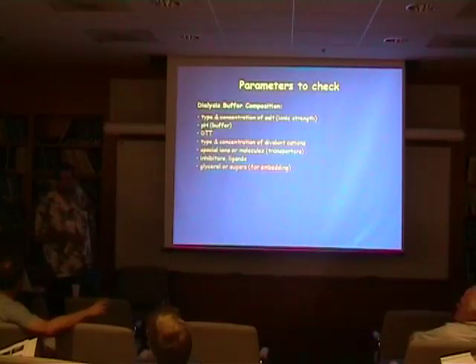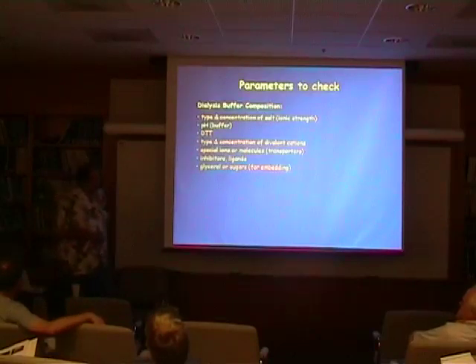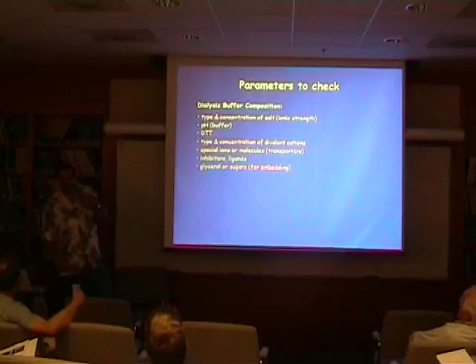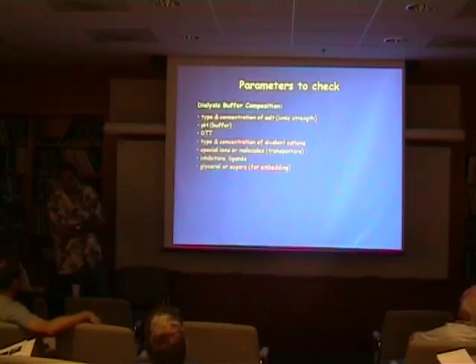Do you think cations or anions are more important, or do you know whether cations or anions are more important? So this is a very special thing to magnesium and calcium. We just use calcium chloride and magnesium chloride. So the salts that you use, I don't know, what about sulfates? We never tried sulfates. So this is another thing that we don't try, but we can try obviously.